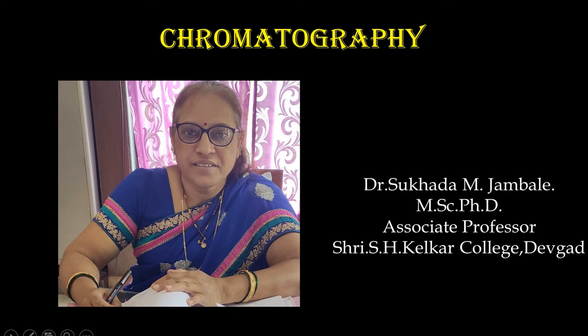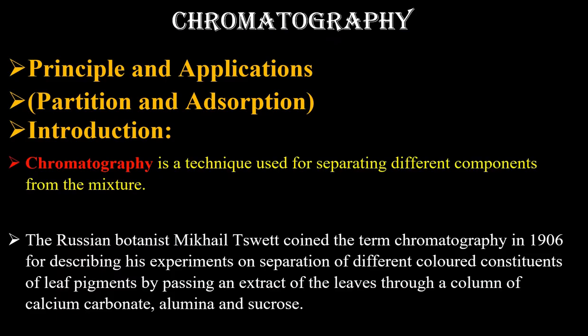This is our next lecture from the series Instrumentation, and today's point of discussion is chromatography, which is a laboratory technique for the separation of the components from a given mixture. Here we'll consider the following points: principle and application, types of chromatography, its introduction, and last one, the application in short.